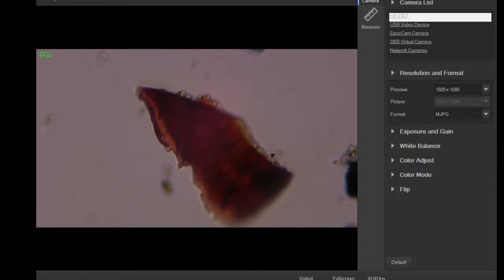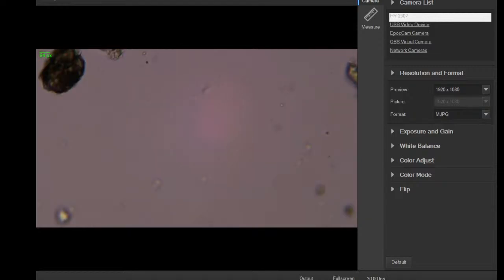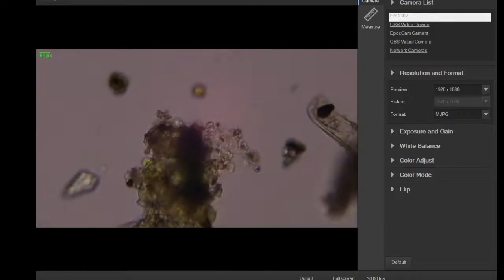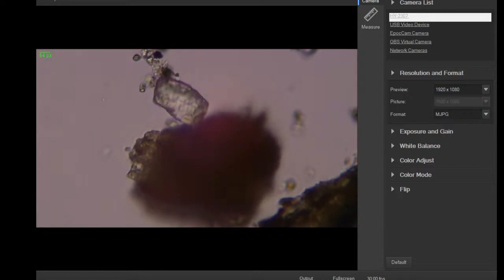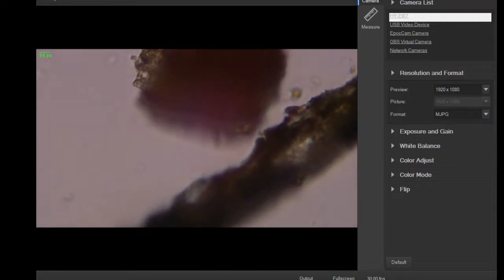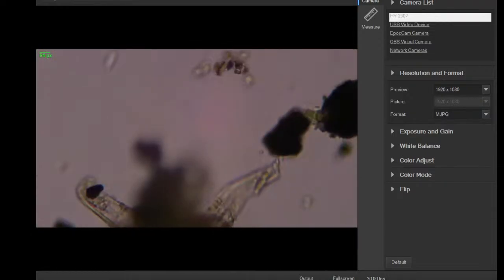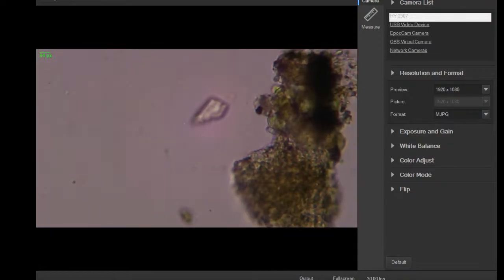Well, it is an interesting experiment. You can see how quickly isopropanol works on at least single-celled organisms and nematodes and stuff like that, because a slide was drying up very quickly the other day and I didn't have time to save it. So rather than having them get munched, I felt sorry for them. I put a quick drop of isopropanol on the slide, and as it traveled through as a wave, it was instantly like a stun gun. They're all just instantly dead as soon as they touch the isopropanol.